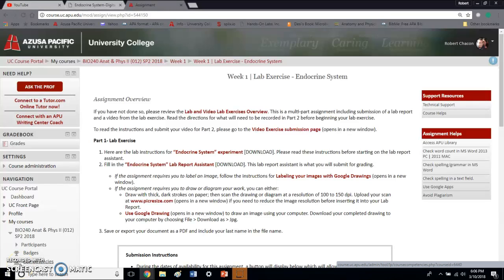Hello, my name is Robert Chacon, and today is March 10th, 2018, and today I will be demonstrating how to label images on the Lab Assistant.